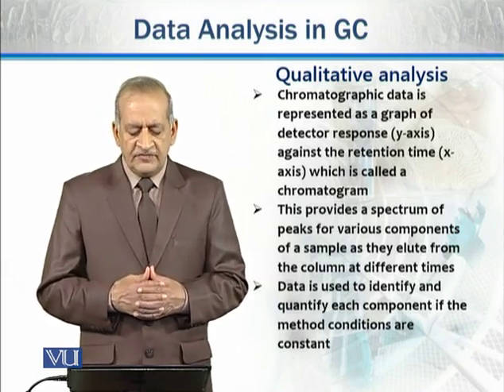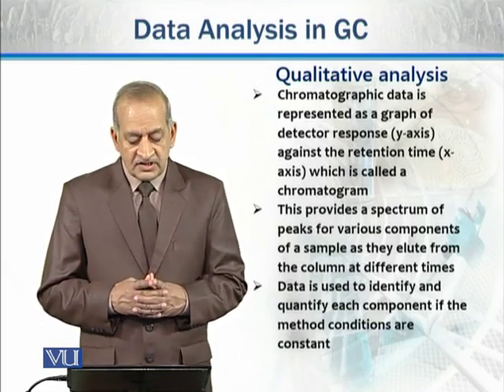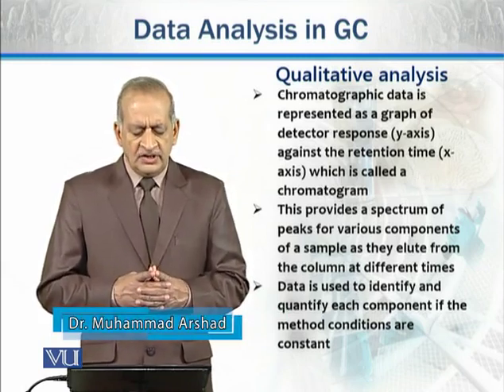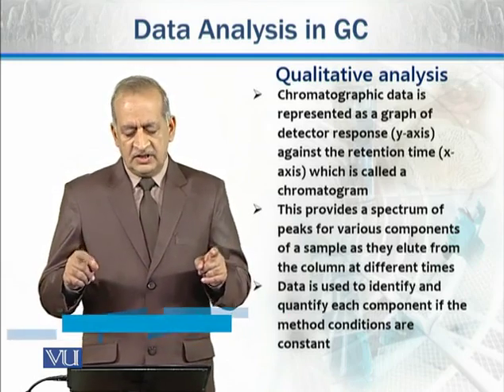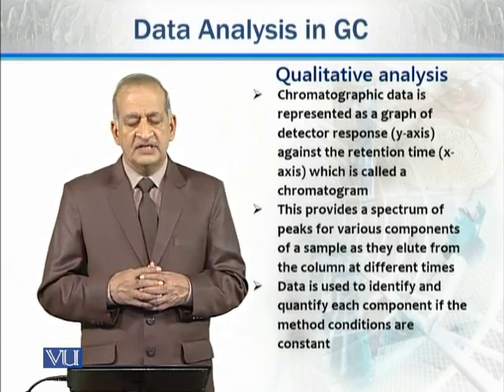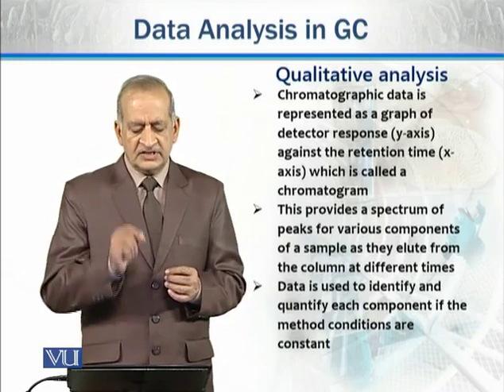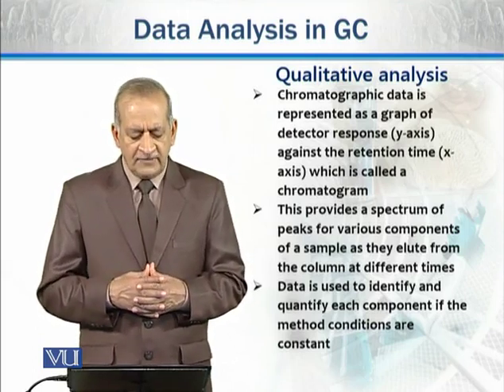Chromatographic data is represented as a graph of detector responses against the retention time of the component. Normally detector responses are plotted along the y-axis, while the retention time is plotted along the x-axis. And this is known as a chromatogram.